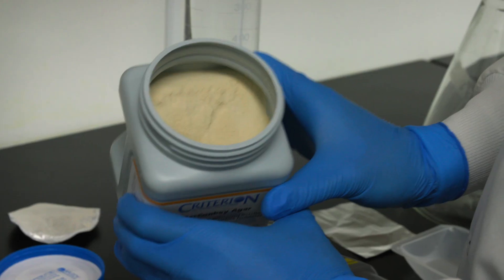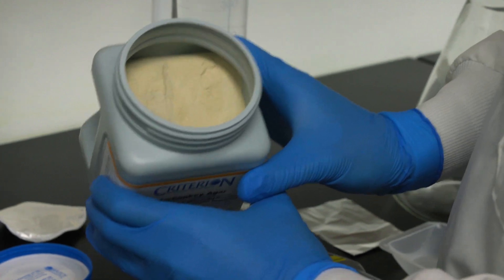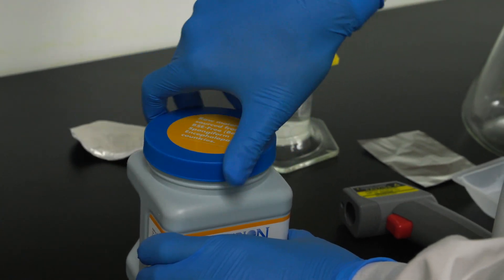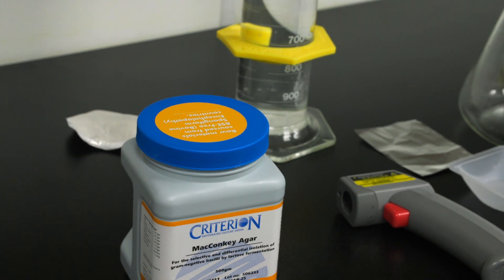The powder should be free-flowing and not clumped or caked. Culture media is extremely hygroscopic, which means that it pulls in moisture from the air quickly. Be sure to close the lid immediately after opening it and keep it tightly closed.